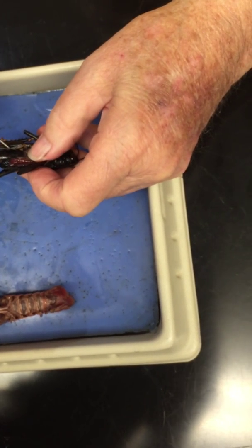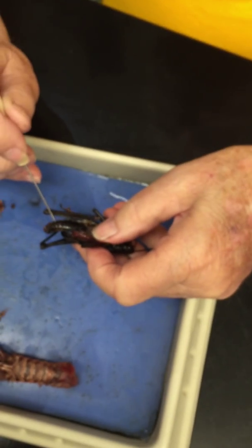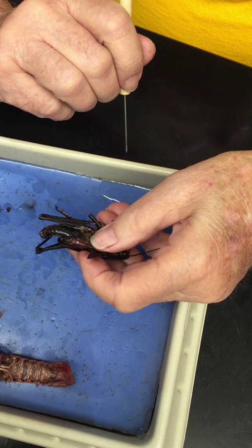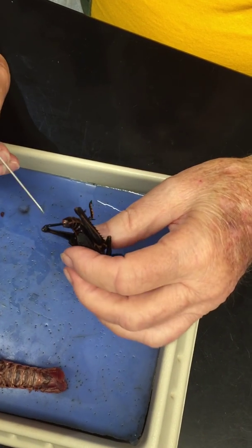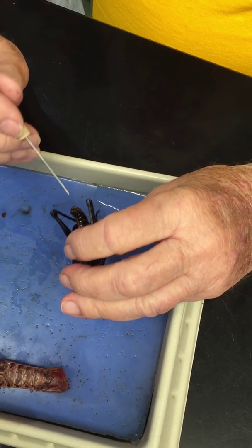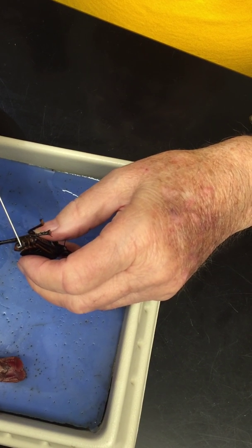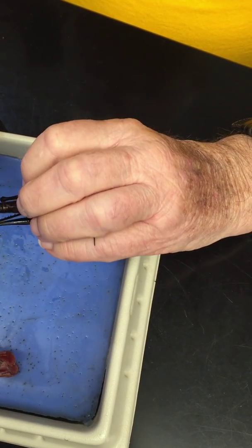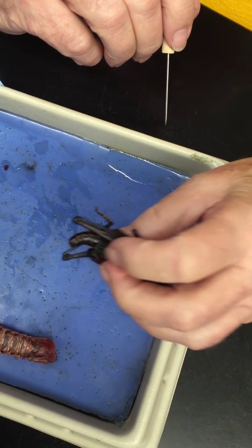All right, now notice that there's a little hole in every single one of those abdominal segments. What are they? Spiracles. Now this one's a male. Right? The anus is right in there. This is a subanal plate. That's a supraanal plate right there. And this little point right there, I think that's called a cercus.